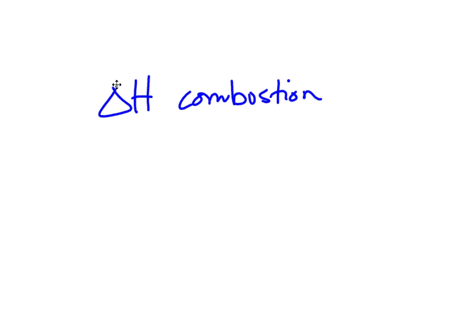Alright, this is your pre-lab video for your heat of combustion lab. The whole purpose of this lab is to burn a candle, and you're going to find out the delta H, the molar enthalpy of the combustion of paraffin.